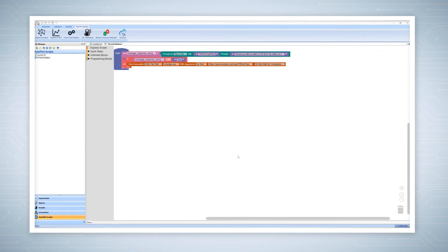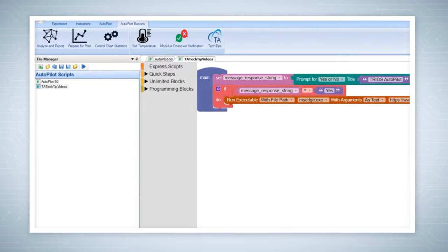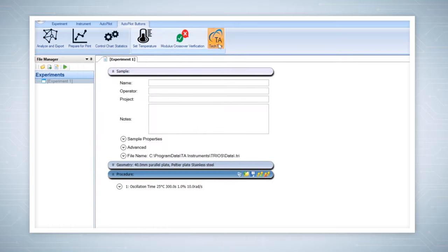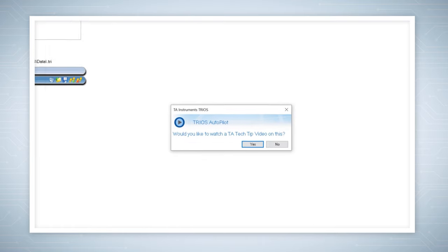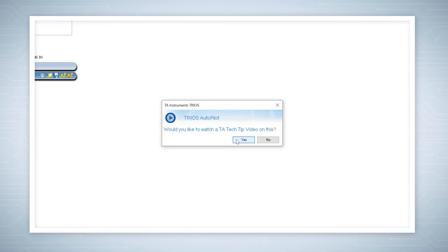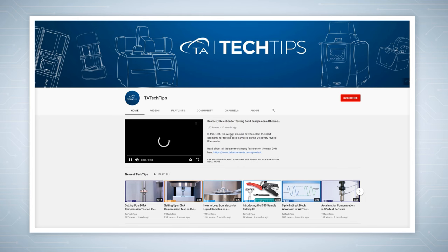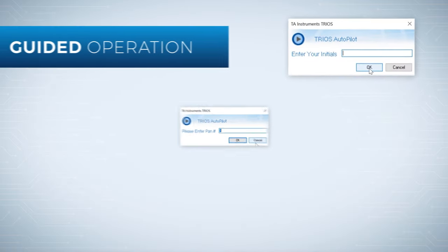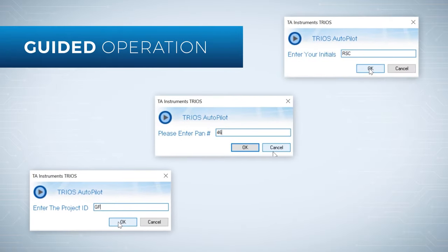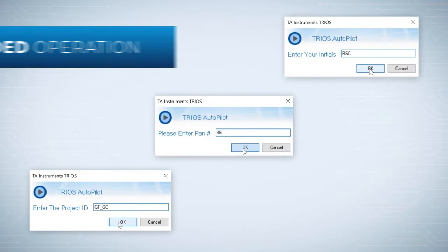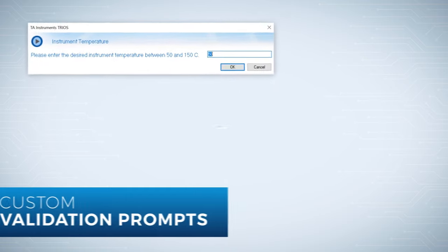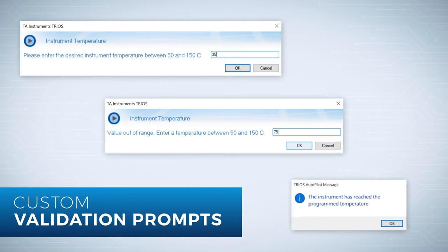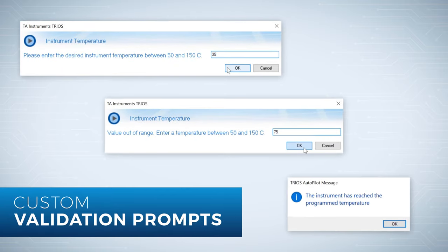Increase productivity using personalized ribbon buttons to automate your routine tasks. Autopilot allows for guided operation with descriptive instruction and feedback. Users can program custom validation prompts, guaranteeing accurate experimental design.